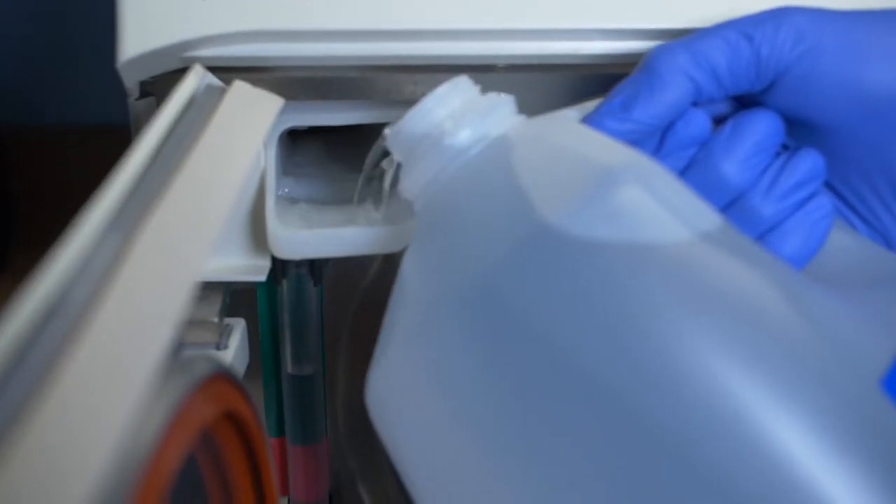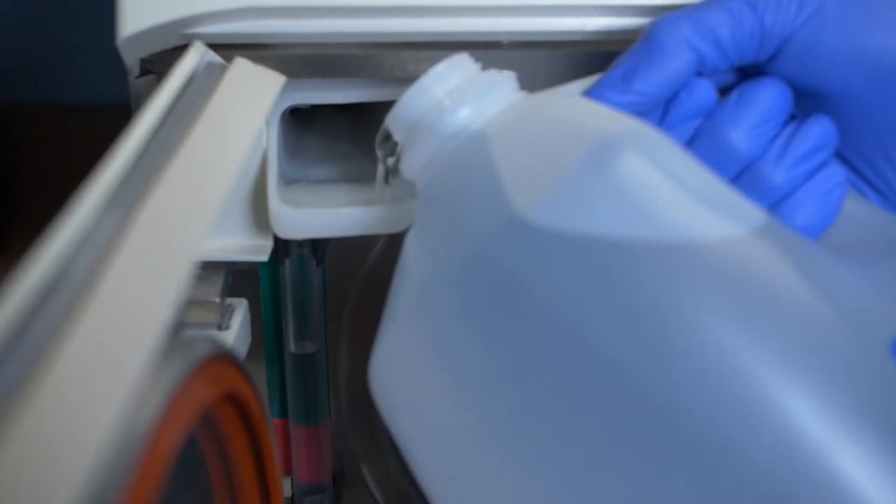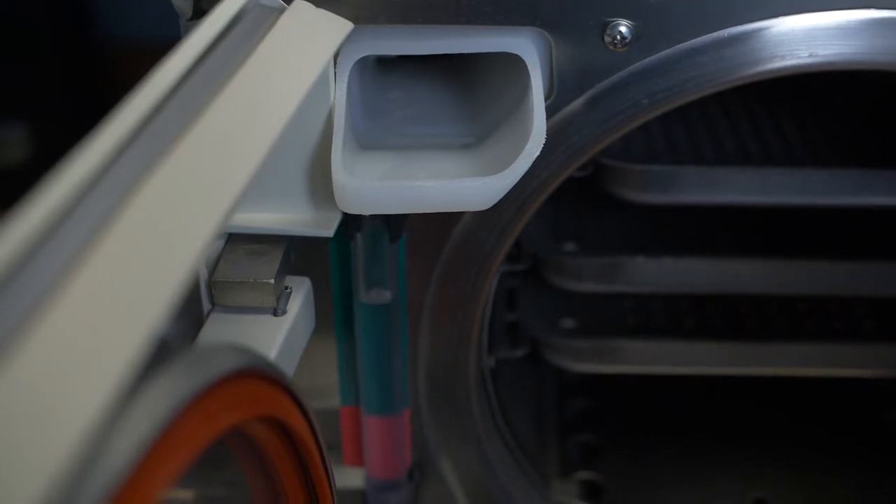Check the water level in the autoclave reservoir and add distilled water to the fill line if necessary. Depending upon your autoclave, turn the knob to fill and allow the water into the chamber until it reaches the fill line. Turn the knob to the next position. This stops the water from continuing to enter the chamber.